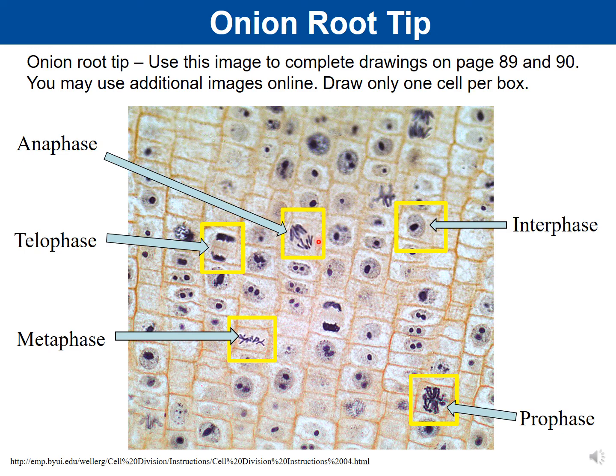Anaphase is where sister chromatids are being pulled to opposite ends. So this would be an example of a cell that's in anaphase. What you have is your cell wall, that's the edge. We have the purple being the chromosomes, and you can kind of see, very faintly, those orangish color lines that are coming out. Those orangish color lines are going to be your spindle. Those are your spindle fibers that are responsible for pulling chromosomes to opposite ends of the cell. Now, again, the spindle is made of microtubules.